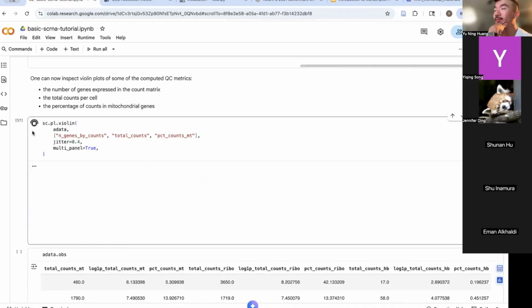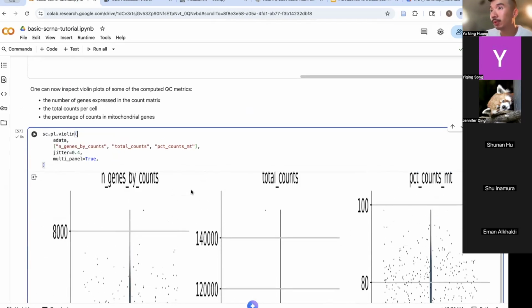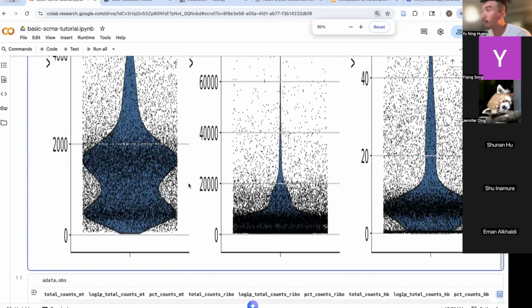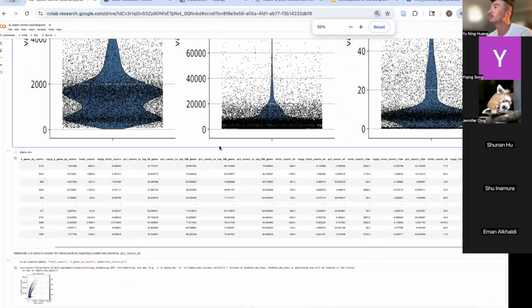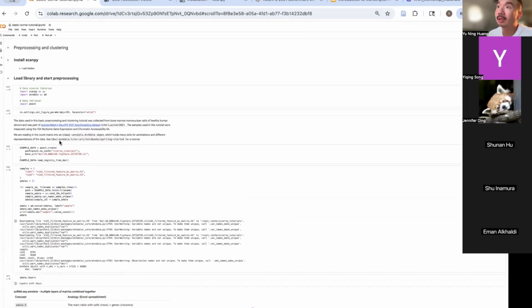So in here, I would say the most important, like yeah. So now I'm going to do. Oh, it looks. Oh, I think it's because of the DPI here. Let me just set it back.